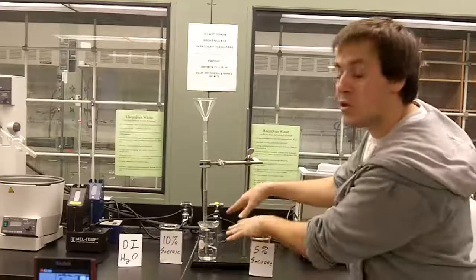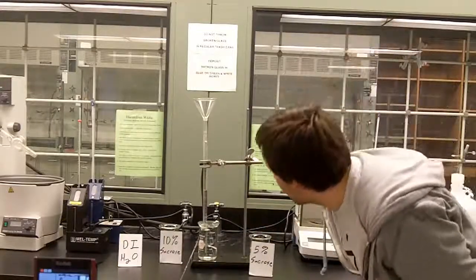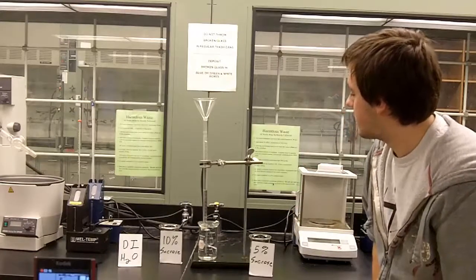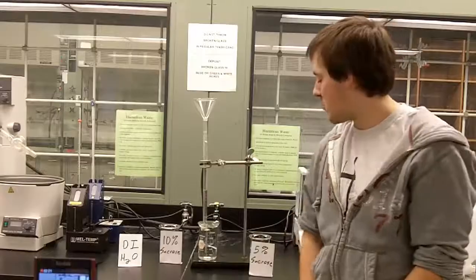Water is going to move from where there's no sucrose to inside the bag where there was sucrose. I believe that's what happened. So that's osmosis — the movement of water across a semi-permeable membrane. Thank you.